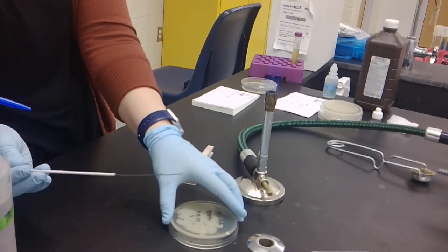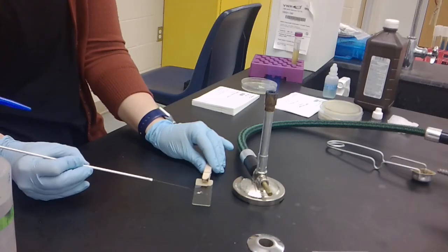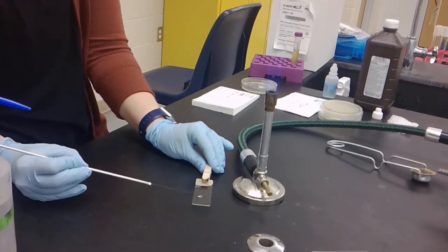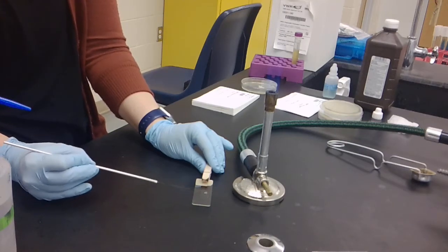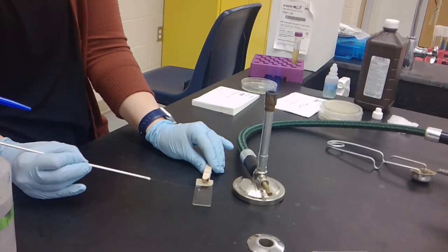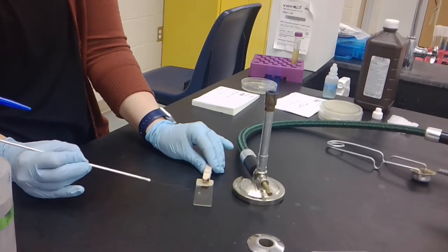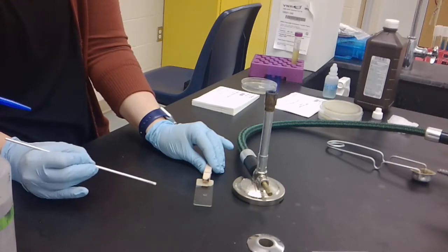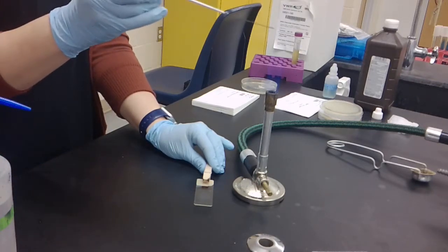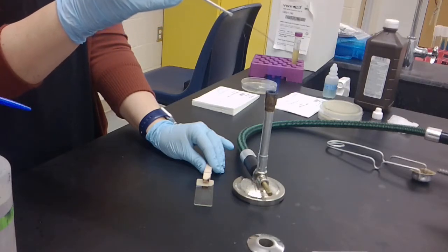Take a small amount of bacteria from your working plate, and you are then going to mix that bacteria very well into that droplet of water. You want to make sure that you don't have a lot of clumps of bacteria. They'll be harder to visualize, and you want to spread the water around on the slide because it makes it dry faster and it gives you a larger area to view cells. Once you're done mixing your bacteria, you can incinerate your loop and then set it to the side.